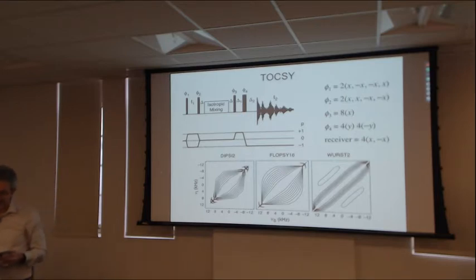So what's shown here then are a series of these that were designed specifically for doing TOCSY transfers as opposed to doing decoupling. And once the focus was on what was essential for doing TOCSY transfer, one could find more efficient sequences, so one could get better performance with reduced RF power. So what happens in this experiment?